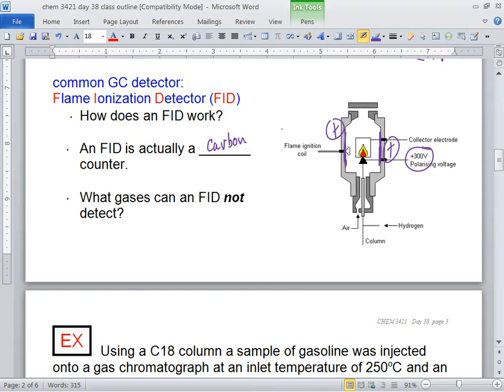So imagine you've got a detector, if you have aqueous samples, you're looking for, like we did, we did a research project looking for any common drug that you take in our sewer water. Because you take samples before the sewage treatment plant and after the sewage treatment plant. And what environmentalists are saying, well, sometimes they know what they're talking about. This stuff is building up in our environment. It's not evaporating, it's not breaking down, because it's built not to. Like ibuprofen, for example, and we found that. We found naproxen too. But the point is, with aqueous samples, there's no background. It can't just see it. So all it's looking for is your carbon atoms. That's kind of nice.